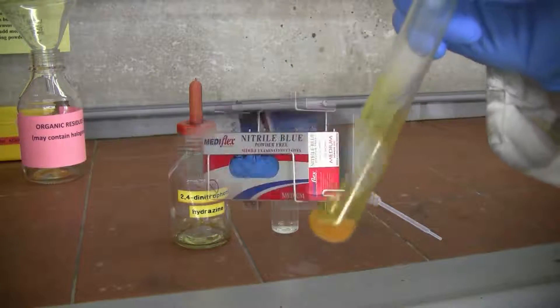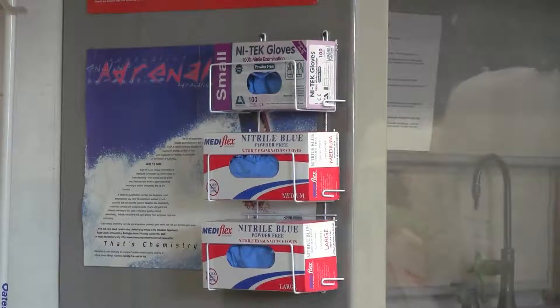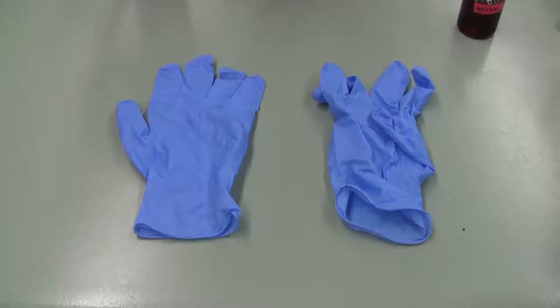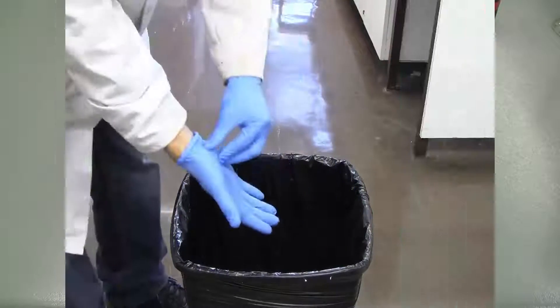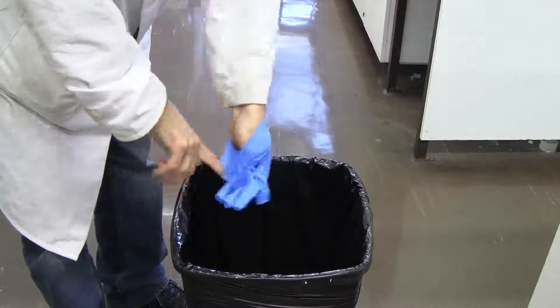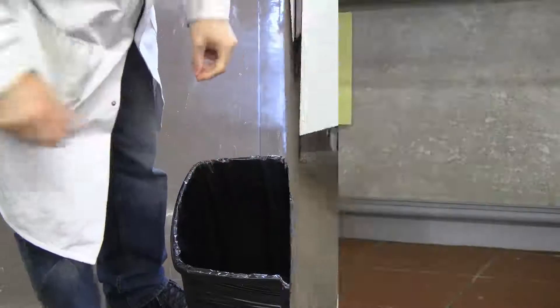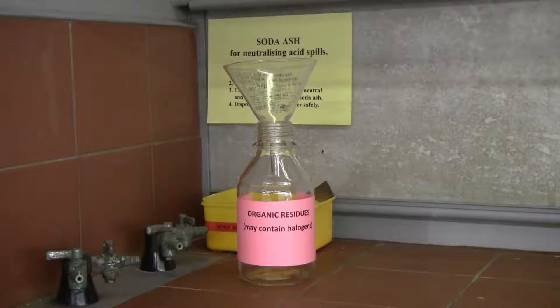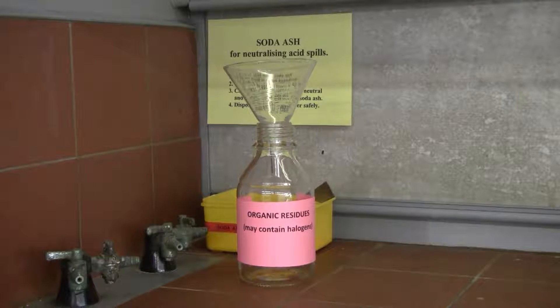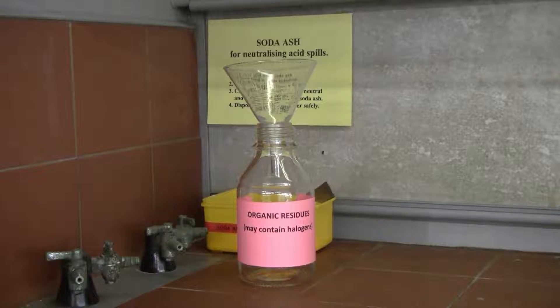Safety is a big deal in this experiment. Depending on your background, this may be the most dangerous series of experiments you've done. Gloves are mandatory. If you spill anything on your gloves, get them off, wash your hands, replace them, and carry on. Nothing down the sink—everything goes into waste. Safety glasses, closed shoes, and lab coats are a must.